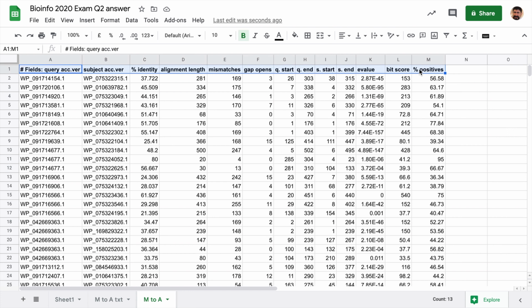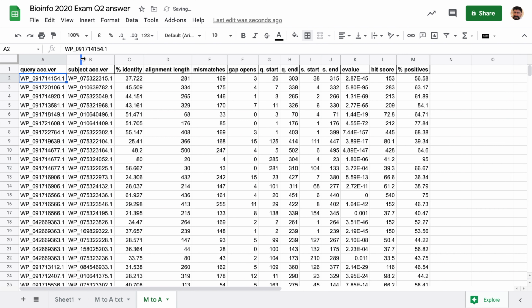Let's select the first column, and we are going to put some decoration to make very clear that this is the title. This is also too big. We don't need to keep this part. Let's delete here. And okay, that looks much better.